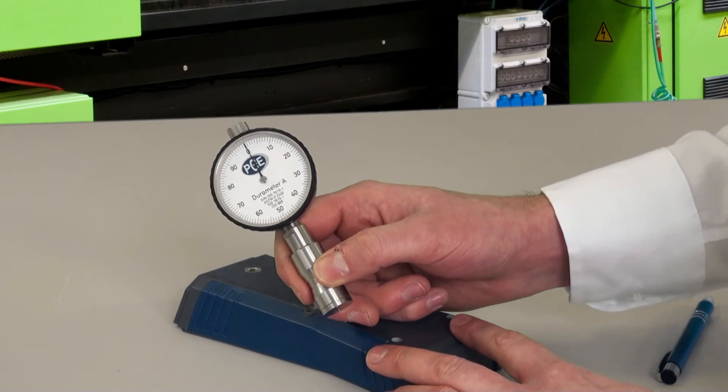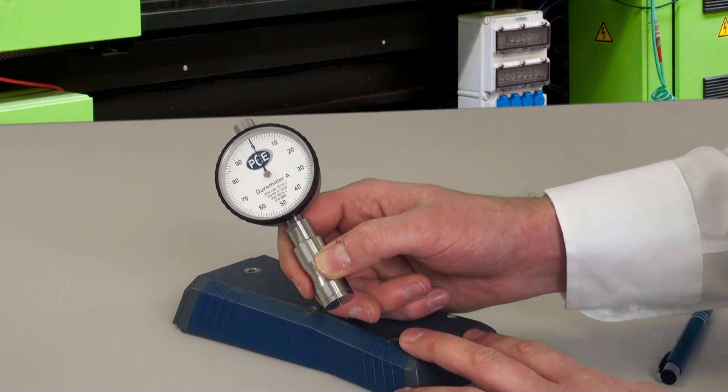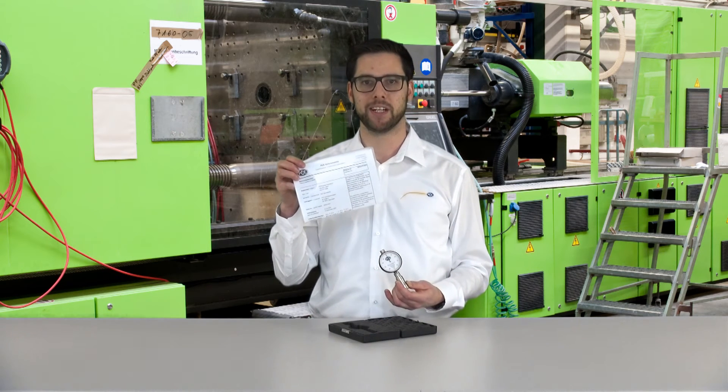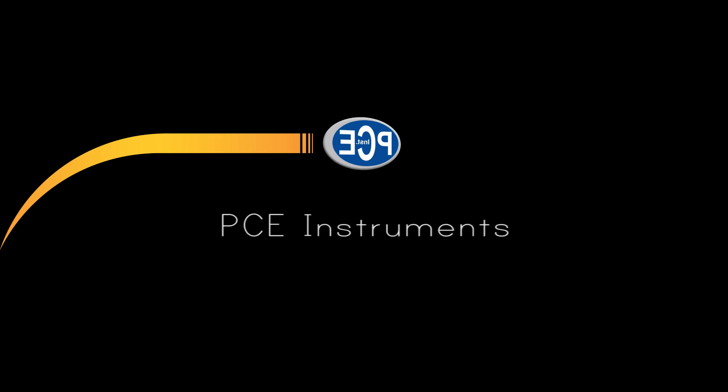So you can quickly perform with the PCE-A durometer in production at quality assurance, make a measurement and carry on with production. The durometer is delivered in a hard plastic carrying case and with a works certificate made in our production. Further information on the PCE-A and the PCE-AS durometer you can find at www.pce-instruments.com.